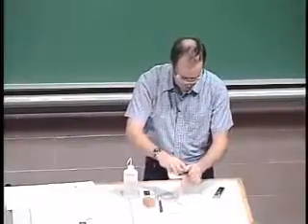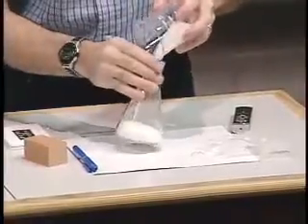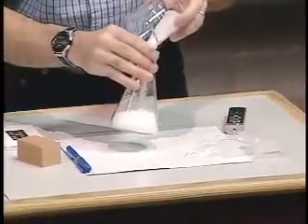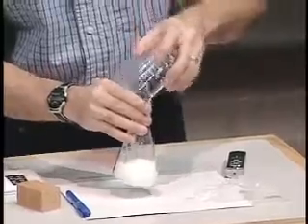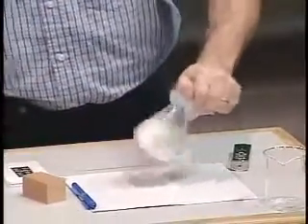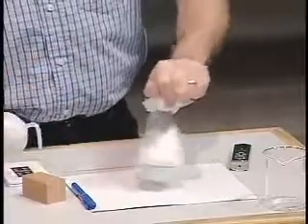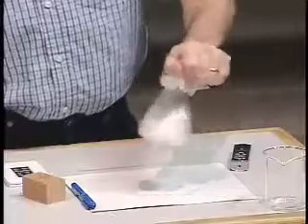And I'm going to mix these two together. Hopefully I can get it all in there without spilling it. And put the top on because it generates ammonia, which stinks. And I'm just going to mix it around here. It's an unusual reaction in that it's two solids reacting with one another.